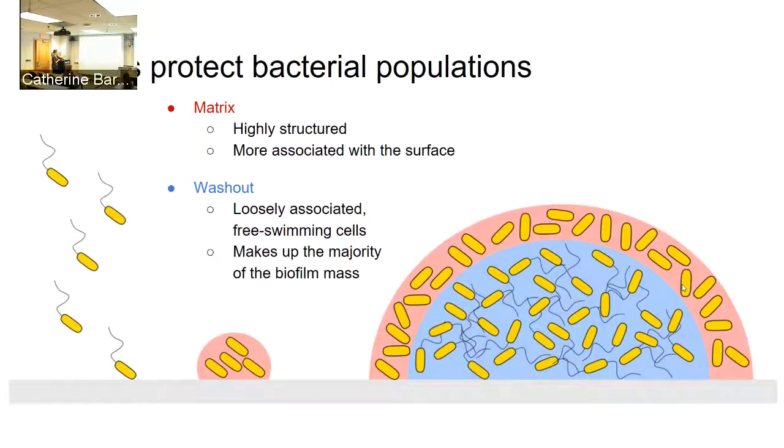I think it's worth thinking about this as a very simple developmental process, because really you're getting effectively differentiation of populations. That's important because it's a reminder that all the methods you're talking about now, you're applying them to UTI-89, but they should be equally applicable to almost any biological system you can get the cross-linker into. Which includes humans.